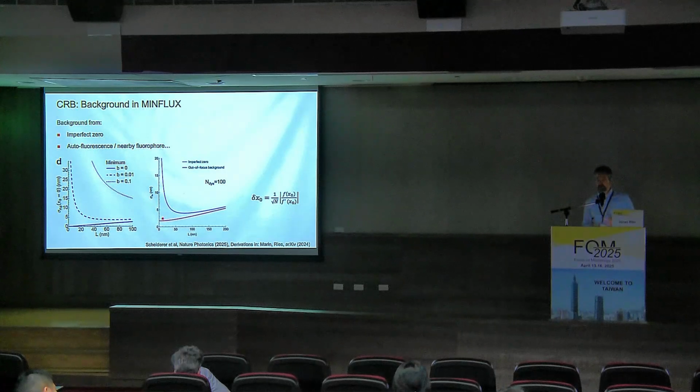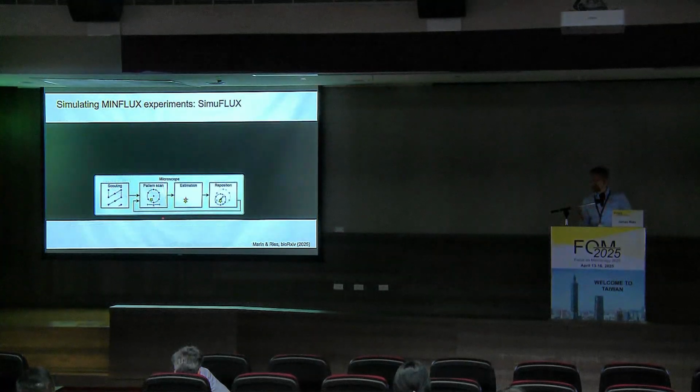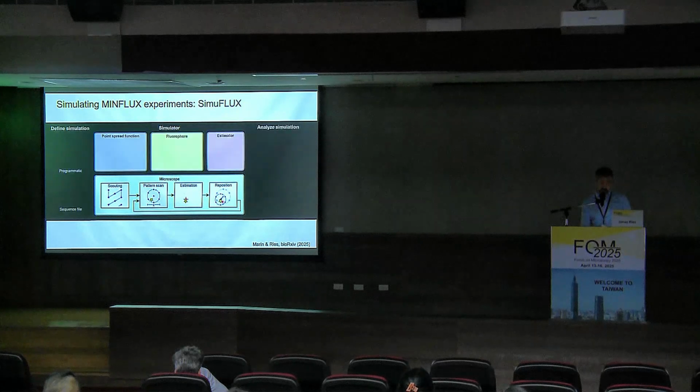Now this was easy, but in general artifacts can be much more complex, and to test these artifacts we have to do simulations. This was something which we just finished and put out on bioRxiv a few days ago, so you can have a look at our MINFLUX simulator. This MINFLUX simulator simulates more or less an Abberior MINFLUX microscope or any other MINFLUX microscope in detail, with the scouting, the scanning, the position estimation, and the repositioning of the detection volume.